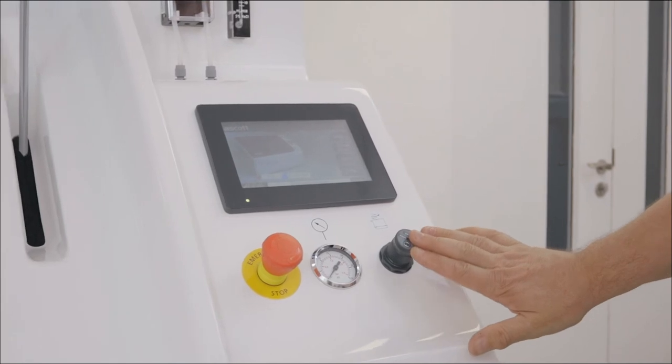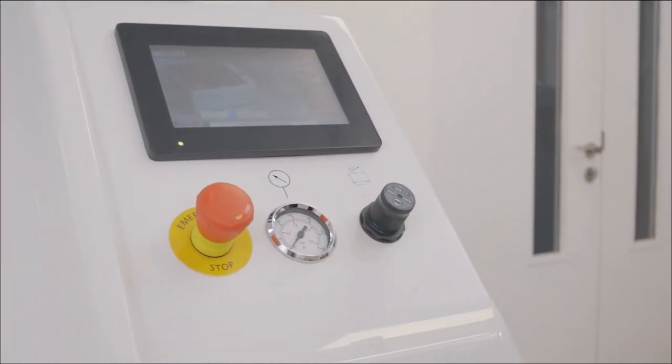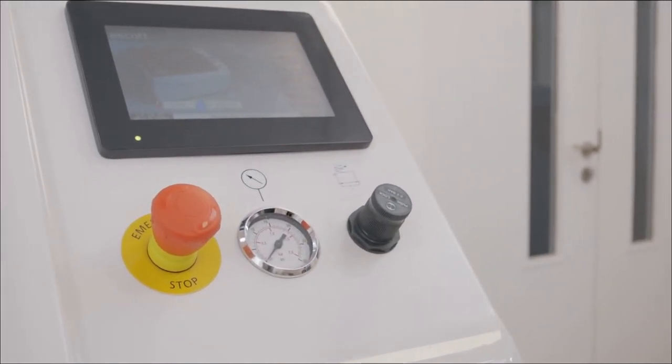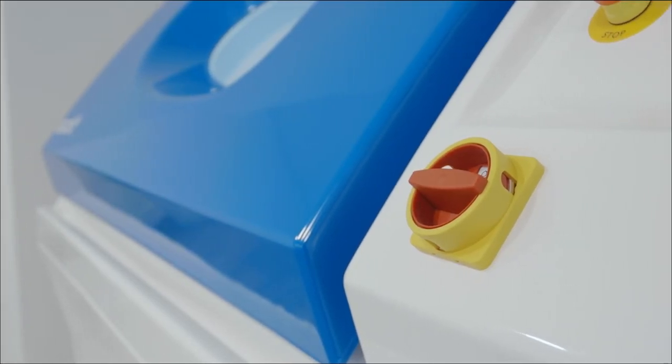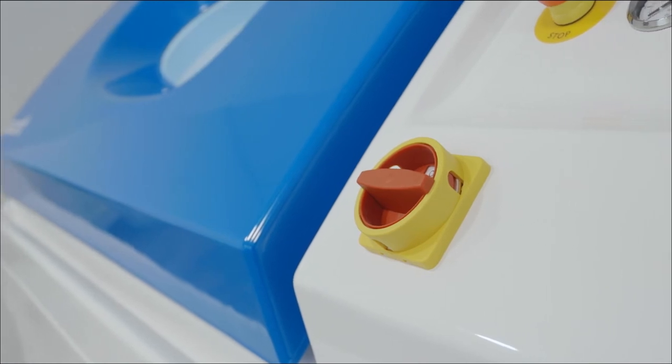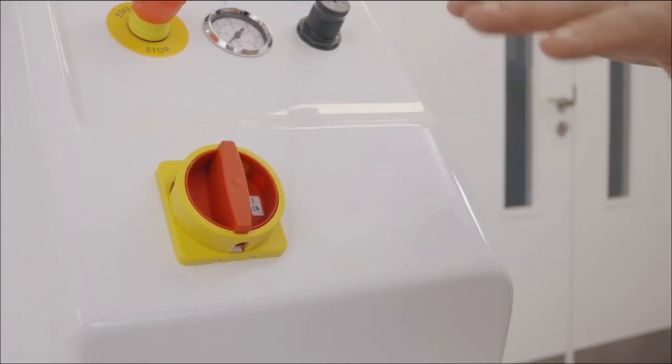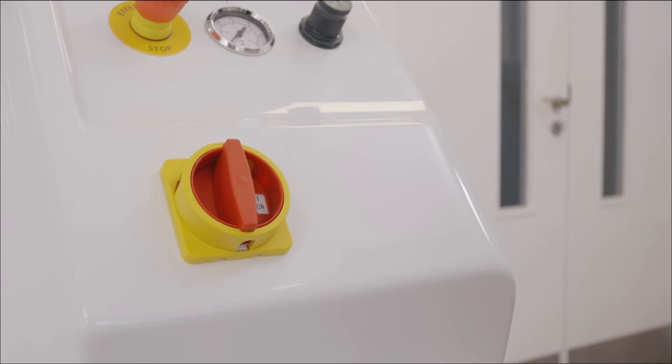We have a regulator and gauge for controlling the air pressure during salt spray testing. Below these we have the mains isolator which can be used to cut power completely to the chamber and in the event of a breakdown be locked out for safety.